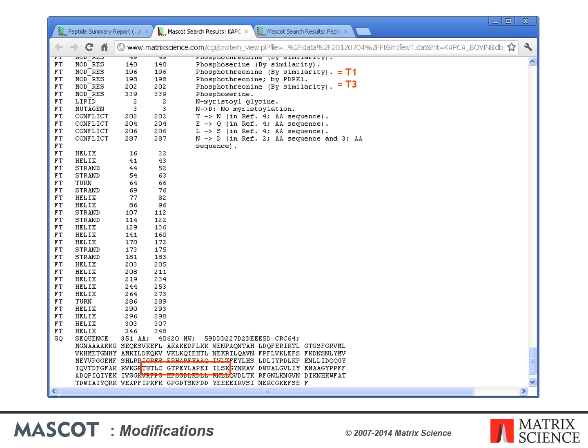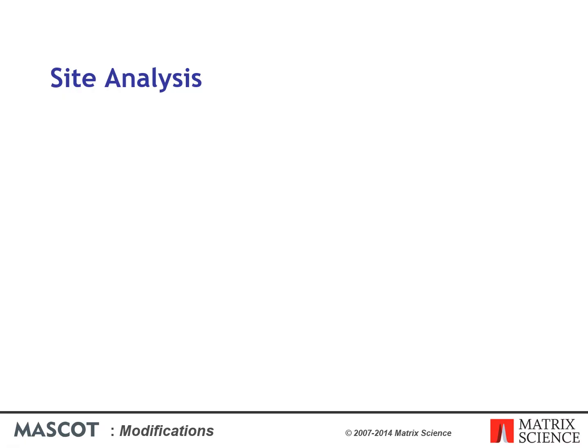If you really need to know which was the case here, or whether it was a mixture, you'd have to acquire more data. Maybe try a different enzyme, or target the incomplete cleavage peptide that includes the preceding lysine and glycine, so as to move the sites towards the center of the peptide, where you might get stronger B and Y fragments. If you are using Mascot 2.3 or earlier, the delta score calculation is not performed in Peptide View.